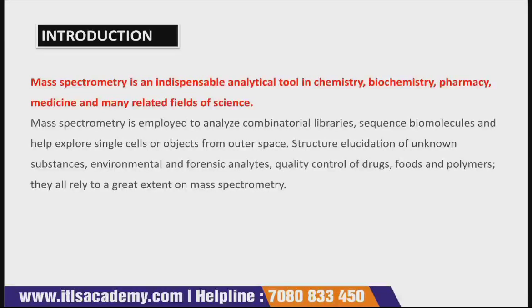Nowadays mass spectrometry is used in many industries. For example, it is used in pharmaceutical industries, in clinical industries, it has a huge application in geological industries as well as in biotechnology and environmental sciences. So this is an important technique covering a huge area of industries.